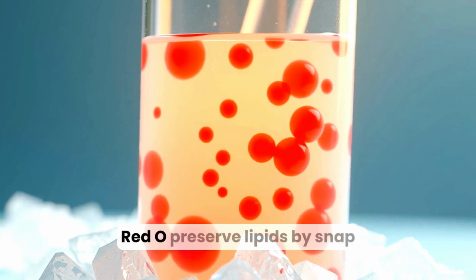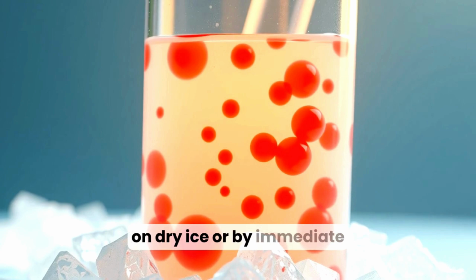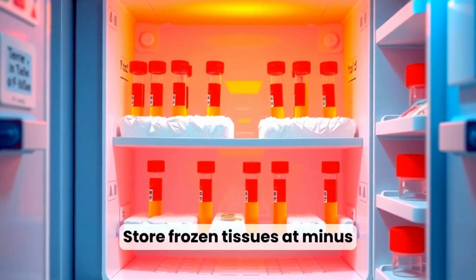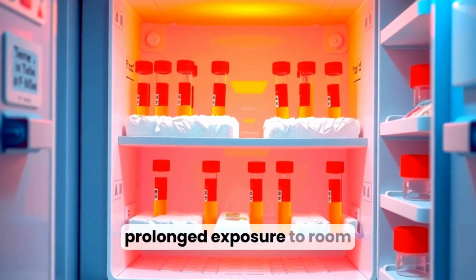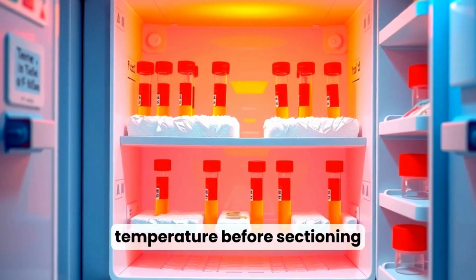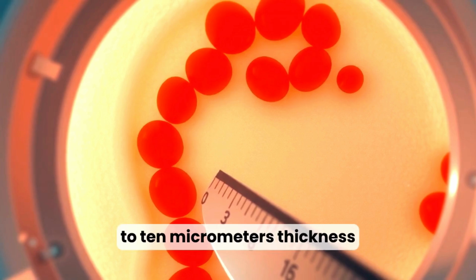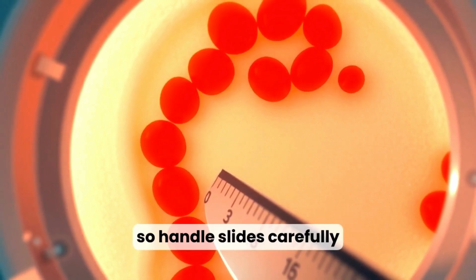For oil red O, preserve lipids by snap freezing in isopentane cooled on dry ice or by immediate freezing in liquid nitrogen. Store frozen tissues at -80 degrees Celsius for longer-term preservation. Avoid prolonged exposure to room temperature before sectioning. Section on a cryostat at 5 to 10 micrometers thickness. Thinner sections improve resolution but can be fragile, so handle slides carefully.